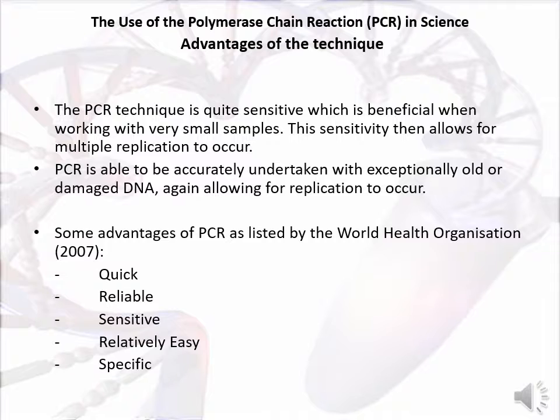The polymerase chain reaction technique is quite sensitive, which is beneficial when working with very small samples. This sensitivity then allows for multiple replications to occur. PCR is also able to be accurately undertaken with either exceptionally old or damaged DNA, again allowing for replication to occur. Some advantages of the polymerase chain reaction, as listed by the World Health Organization, include that it's quick, reliable, sensitive, relatively easy, and specific.